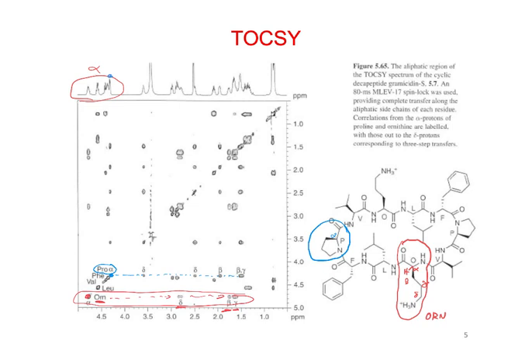Then we see that we have 2 beta protons. They're diastereotopic because they're next to the chiral center. Then we have beta, alpha, beta, gamma. Here's the gamma over here, and those are mostly together. And then we have the 2 delta protons, which are really diastereotopic, right there. So again, we can isolate all of the spins within a certain spin system.